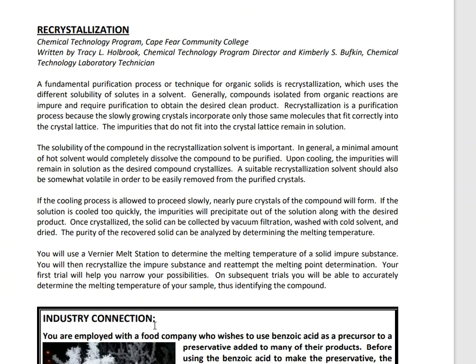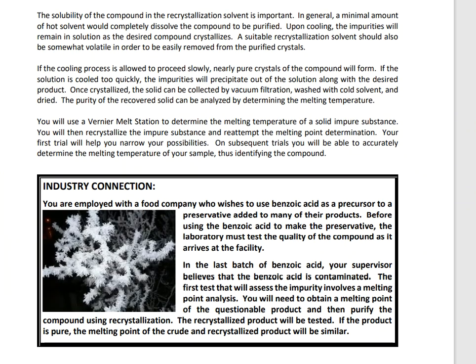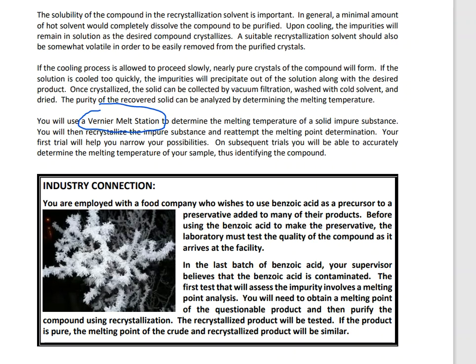So in this laboratory, we're going to be testing your recrystallization technique through the use of the Vernier Melt Station. So this means that we are going to be looking at melting temperatures before and melting temperatures after. And we're going to compare these melting temperatures to see which one is closer to the true textbook value, to see if our recrystallization technique made any difference or not.